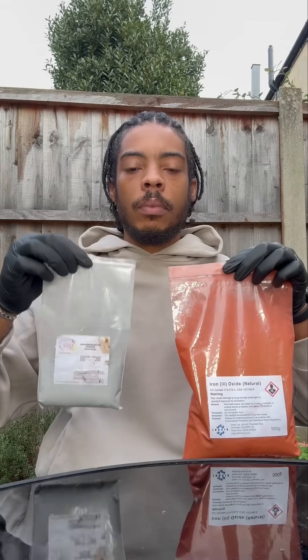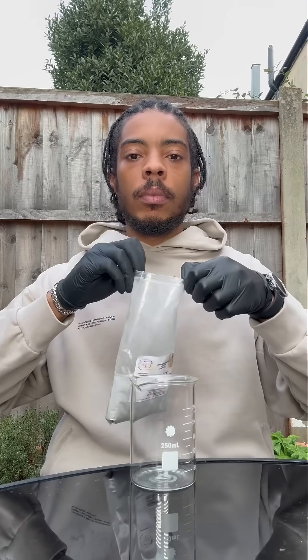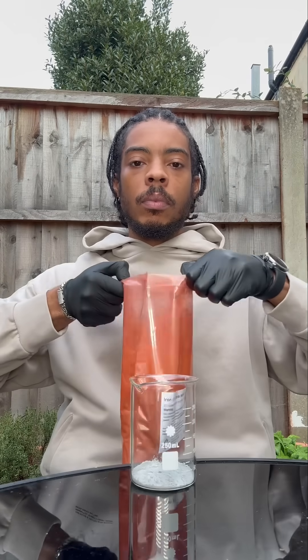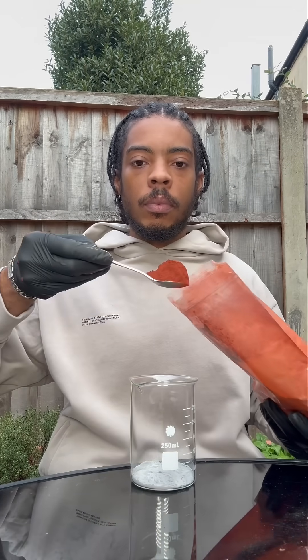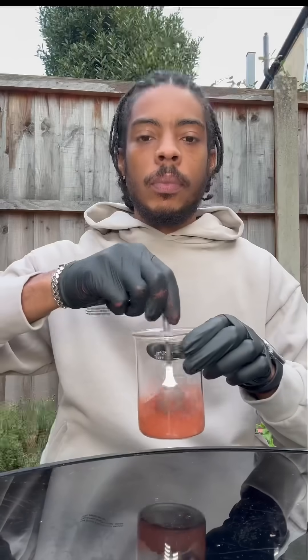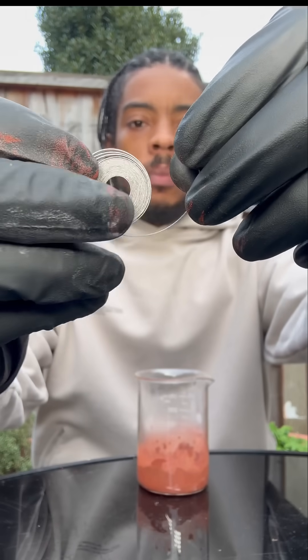Please don't try this at home. We've got some aluminium metal powder and iron oxide, and we're going to mix them together. This reaction is called a thermite reaction. Thermite burns at 2500 degrees Celsius. We're putting a little piece of magnesium in it, and this is going to act as a fuse to initiate the reaction.